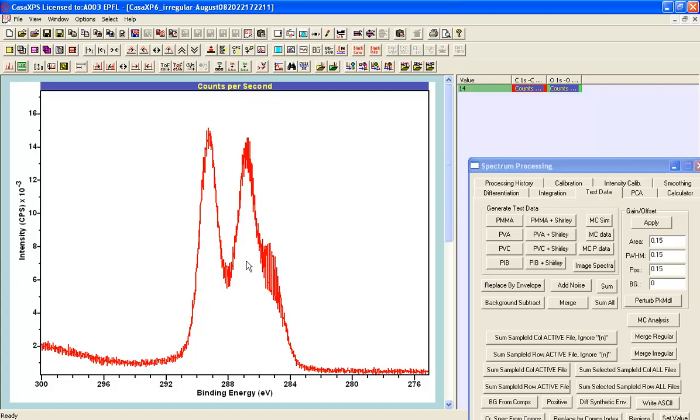And the reason this is a reasonable thing to do is it gives you a data file and a VAMAS block, in this case for the carbon 1s, that can be used to fit components to the data in an average sense based on a nonlinear least squares fit.